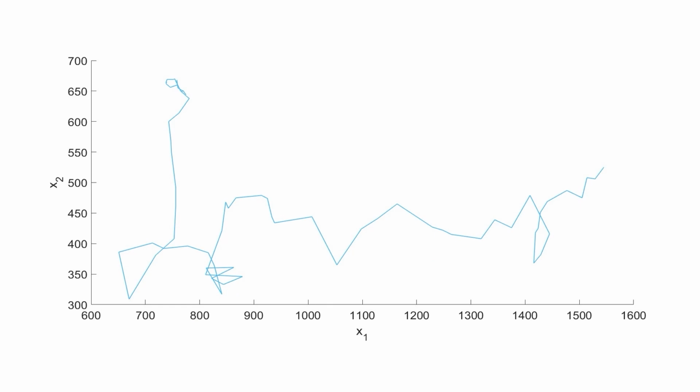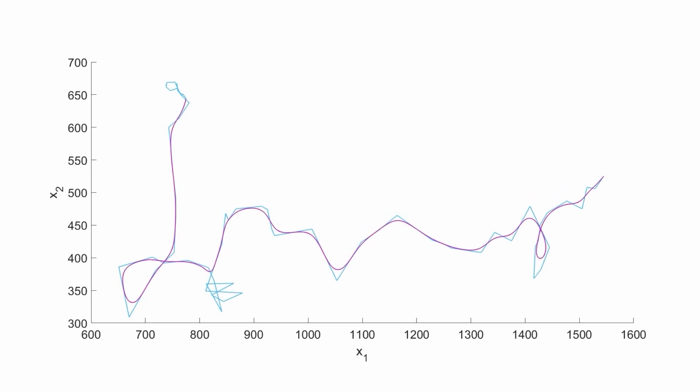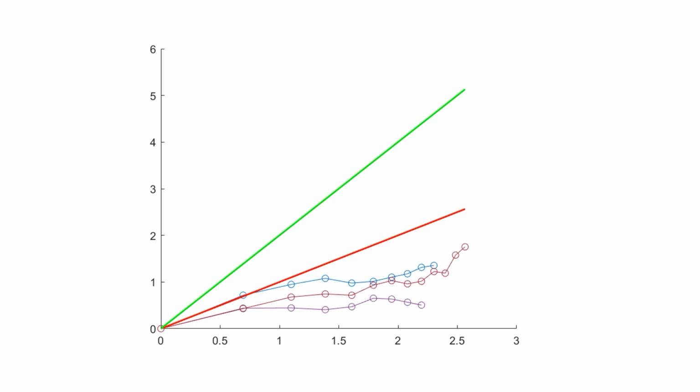In this presentation, I showed you a workflow to analyze the diffusion behavior of macrophages. First of all, we smooth the trajectories. Then, we distinguish between active and passive parts of motion. And finally, we use the mean square displacements to distinguish the diffusion behavior of the passive parts.